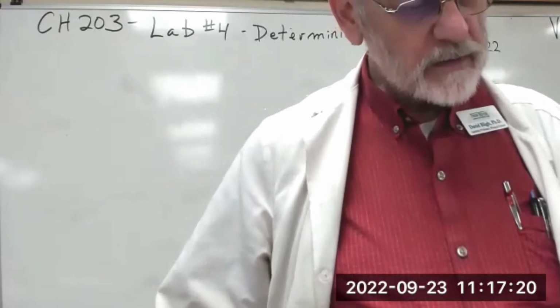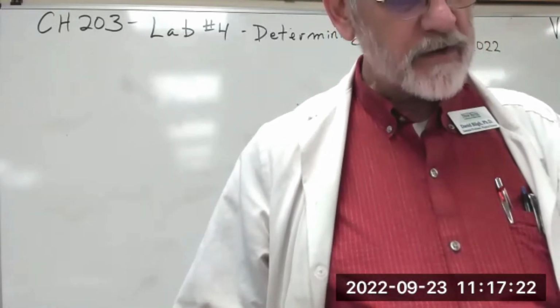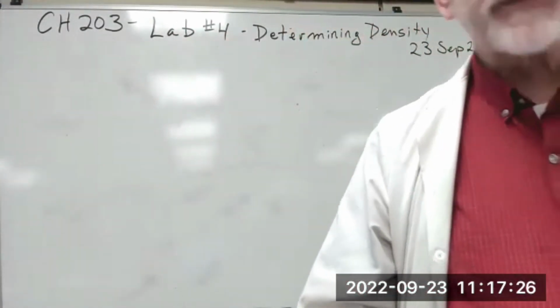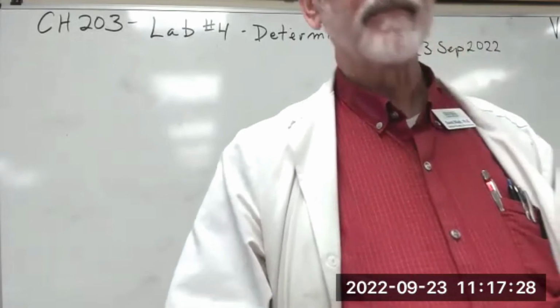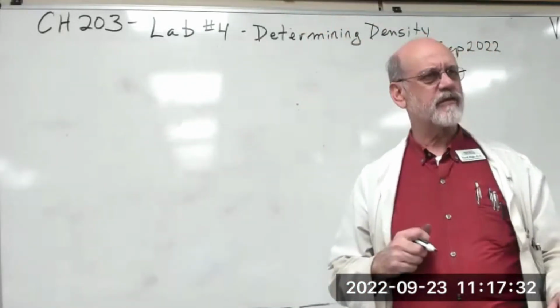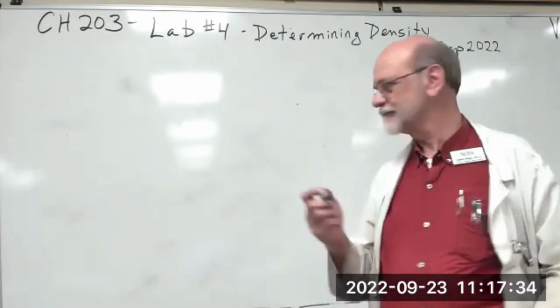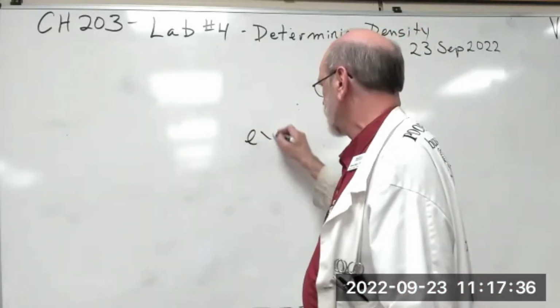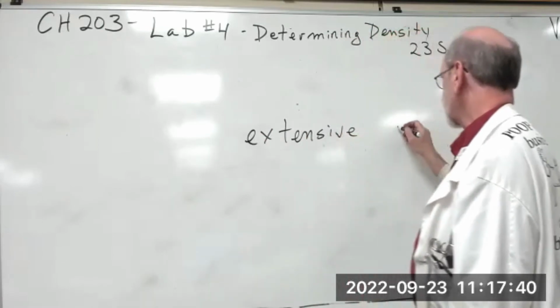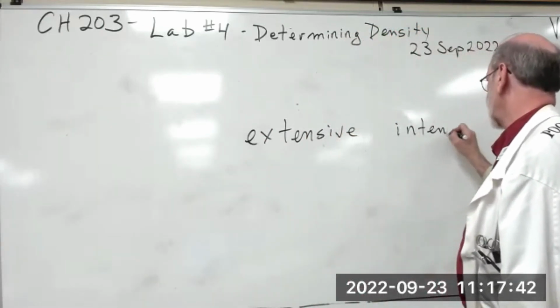Number 2, define the following terms. Okay, density, you can do that one. What's an extensive property? We talked about that before, didn't we? Extensive versus intensive properties. It bears repeating. Extensive versus intensive.